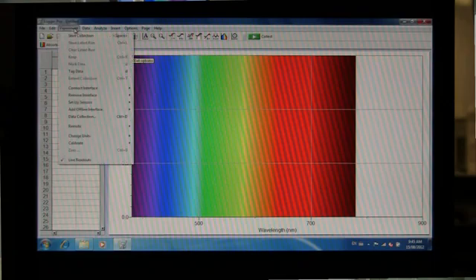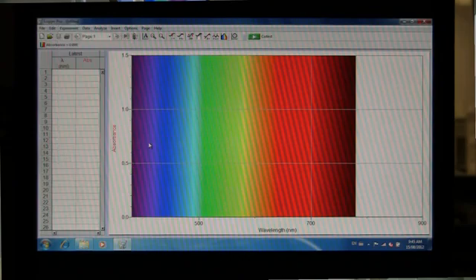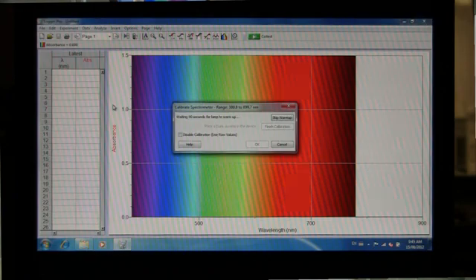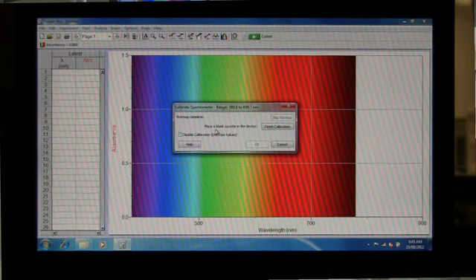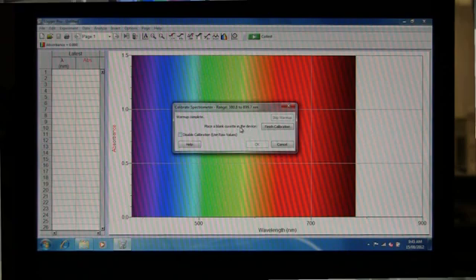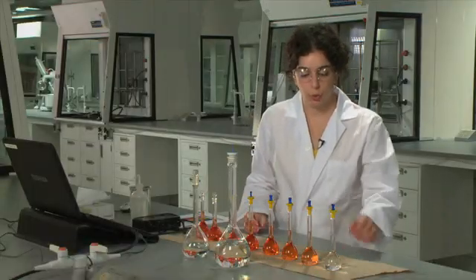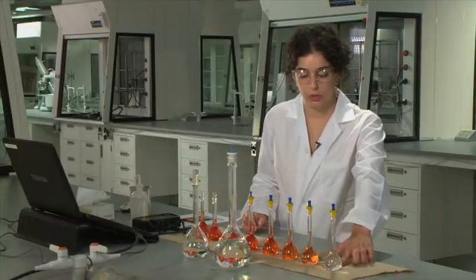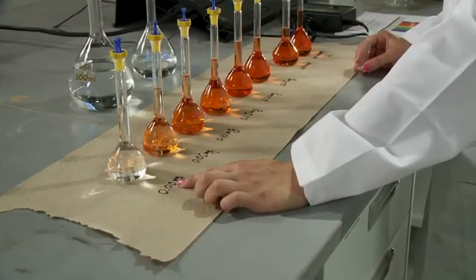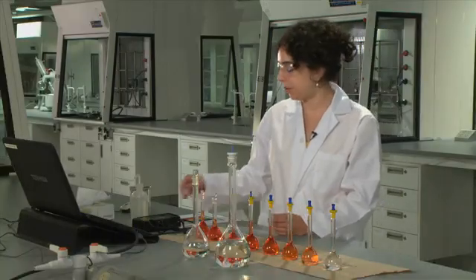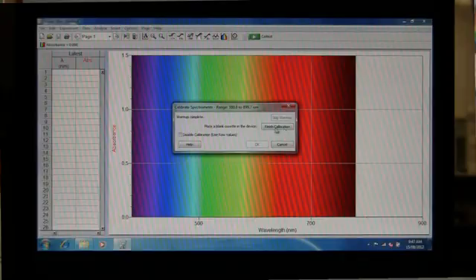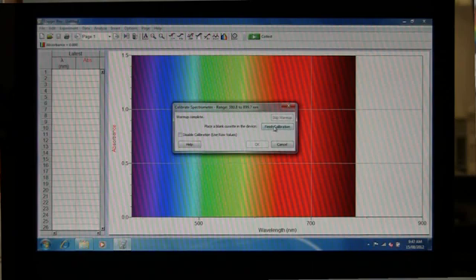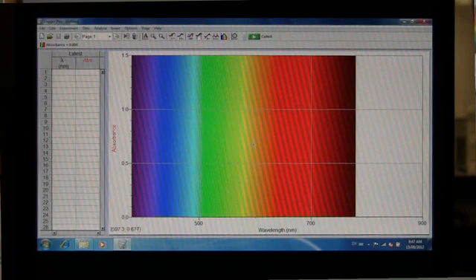We have to first calibrate the instrument. So to do that, we're going to go into Experiment, and go down to Calibrate, and click on Spectrometer. And you'll see a window pop up telling you that the lamp is warming up. When the warmup has completed, it'll then prompt you to place your cuvette in your device. So you would start off with your blank solution, so the one solution in your standard series that contains zero milligrams of iron. And then you will put it in the spectrophotometer, and then click on Finish Calibration. And after a few seconds, you'll then be able to click OK, and your spectrometer will be ready to run your experiment.